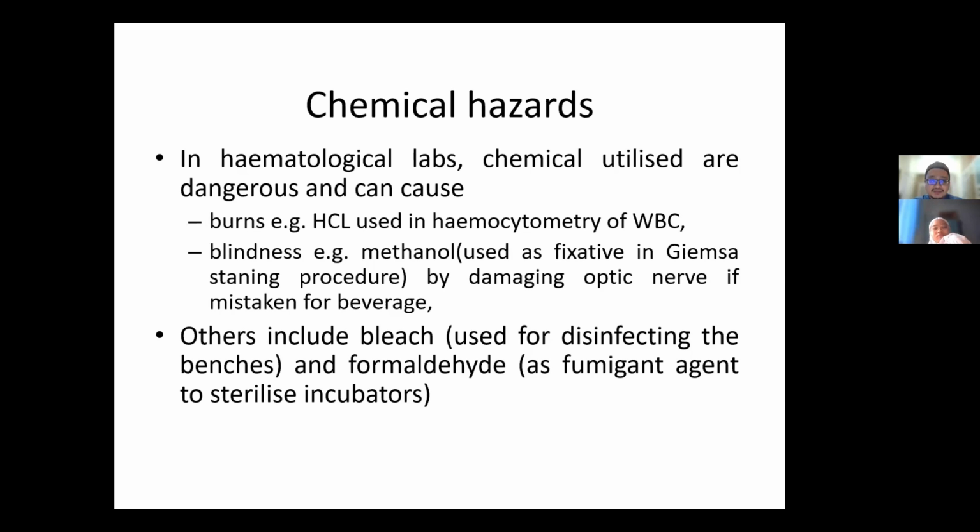Chemical hazards. In the hematology lab, the chemicals utilized are dangerous and can cause things like burns. Hydrochloric acid can cause this. Methanol can cause blindness if you happen to mistake it for a beverage. Very rare, but it does happen.